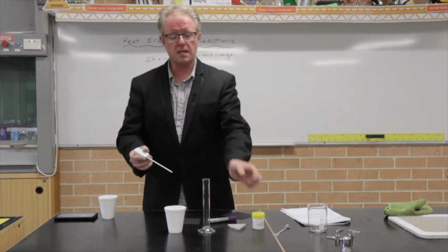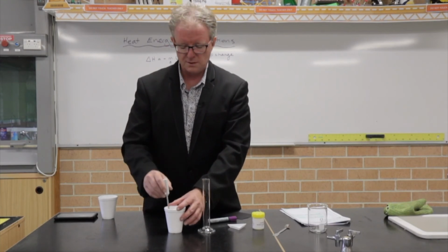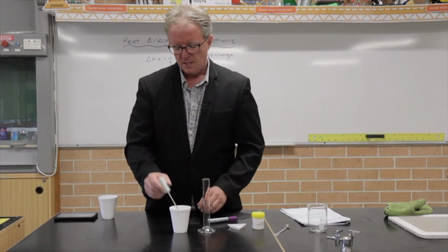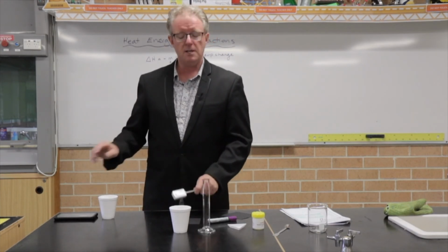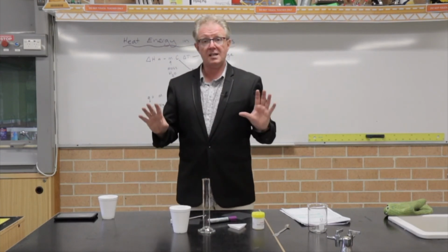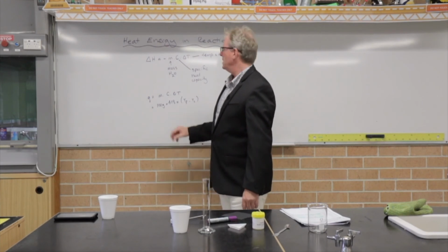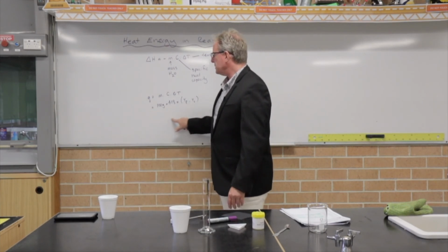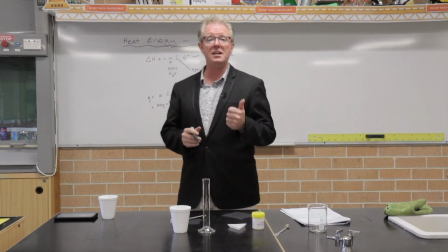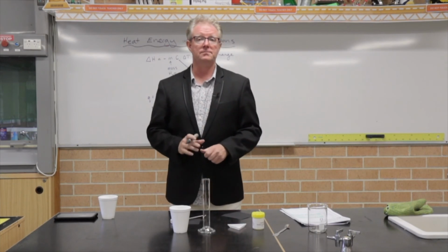Then, of course, you pour your chemical in and you give it a mix. You can mix it gently with the probe, not too vigorously. You don't want to just wreck it, so just mix it gently. And as you're mixing, then you're going to notice the temperature go down or up, depending on the chemical that you use. Once the temperature has stabilized, it's not changing anymore, that'll be your final, okay? And so when you do that, you'll end up with a number, and that's going to be the temperature change, that's going to be the amount of energy that has been released or absorbed by that particular chemical, all right?